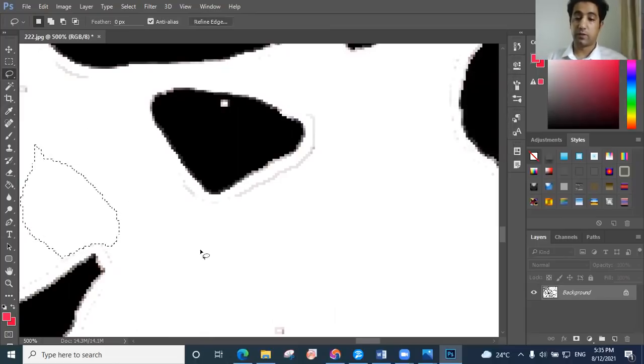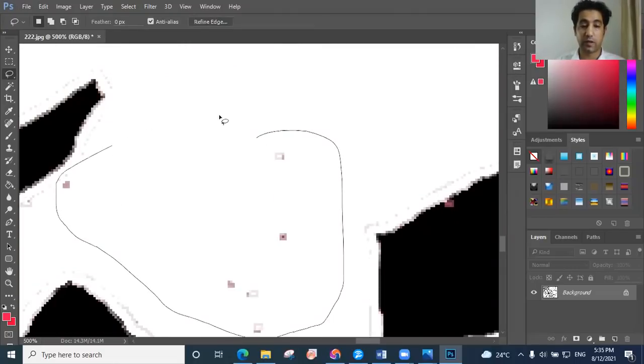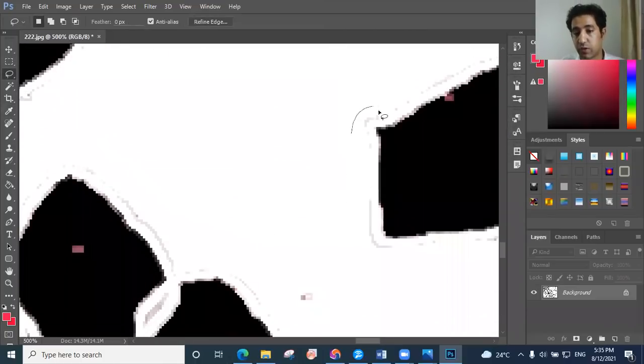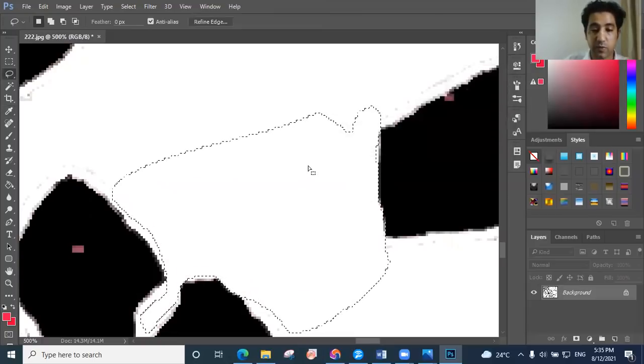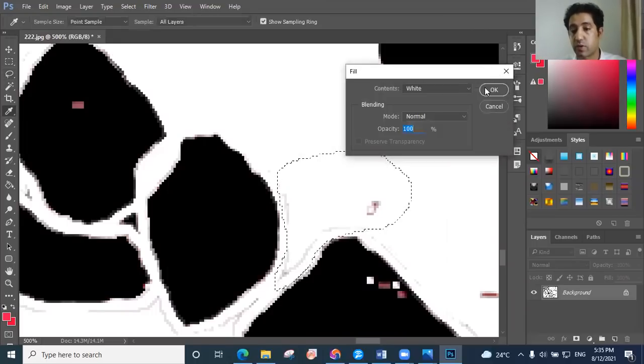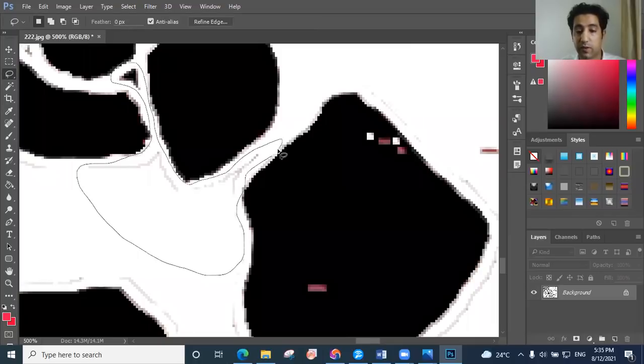It's just a little, you need to be patient because of this. Some microstructures, nothing occurs like this. You just need to clear little things and then everything will be easier. It takes 10 minutes maybe or 15, but this problem occurs with some microstructures. So it's better to know how to deal with this problem. I choose this to explain because some people cannot and then give up.